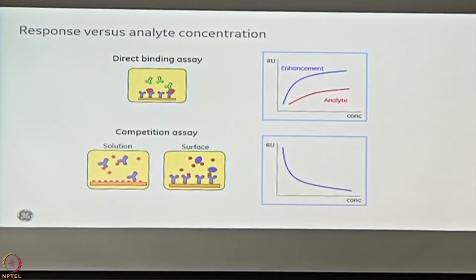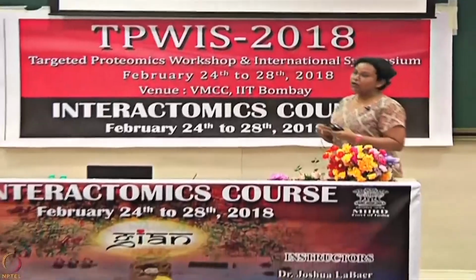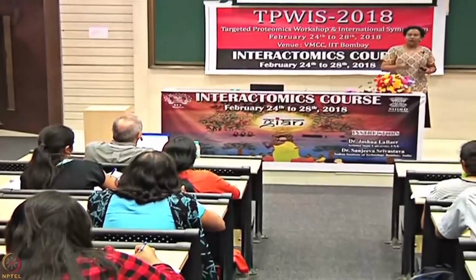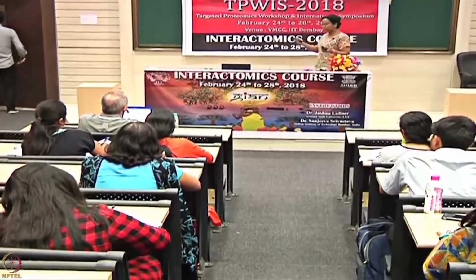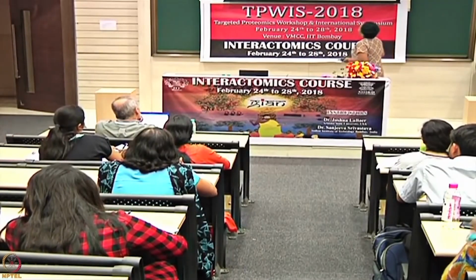So on the direct enhancement, I don't even get the rate constant somehow, or isn't that dependent on the rate of the enhancing molecule binding? That's right. So, you probably will not get the rate constants there. You can only do certain applications like concentration determinations. I see. Yeah, that's a very good point. Yes. So, these are various formats that are offered, but then again it is limited to what applications you are using it for.